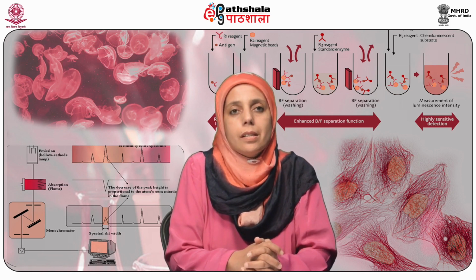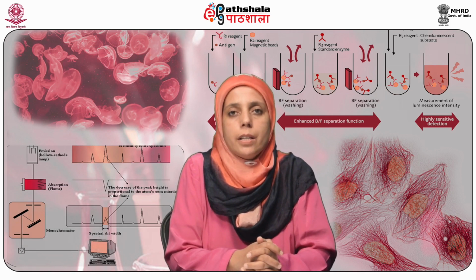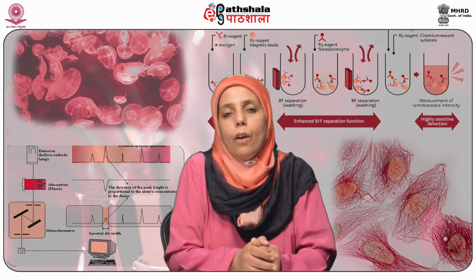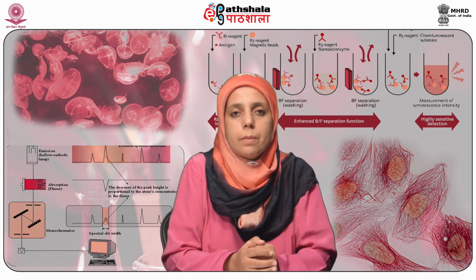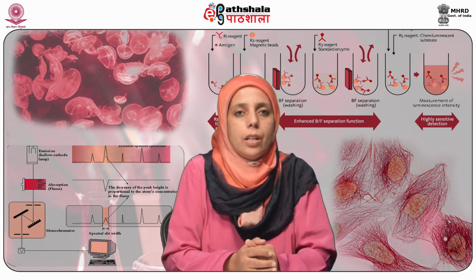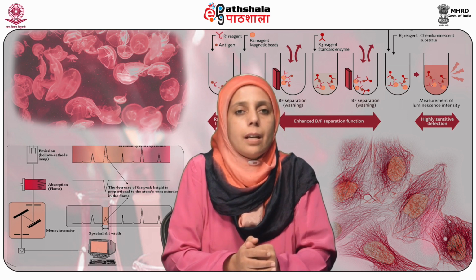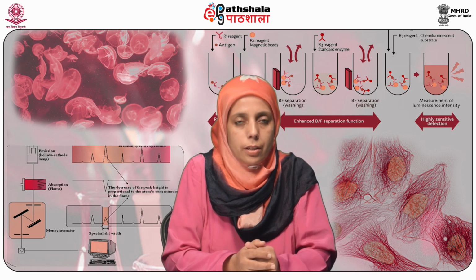So, we already know about fluorescence by now. Fluorescence is an emission spectra, and this emission spectra provides information for qualitative and quantitative analysis of substances. This is called molecular luminescence procedures. Luminescence is most conveniently defined as the radiation emitted by a molecule or an atom after it has absorbed energy and gone to the excited state.